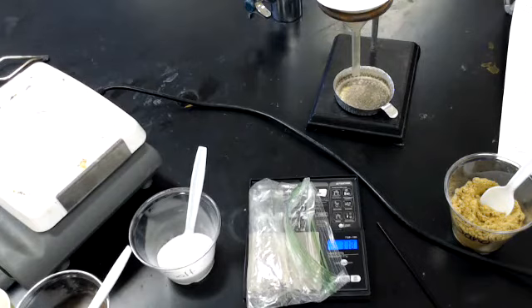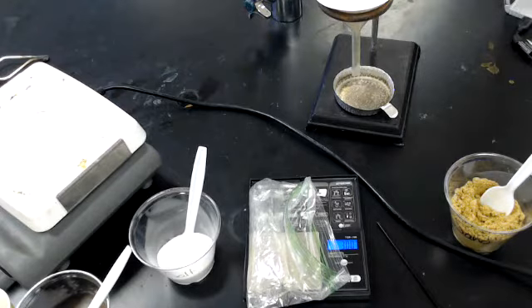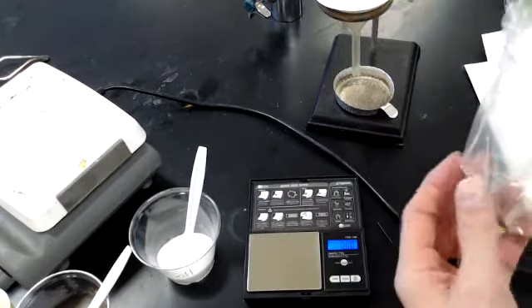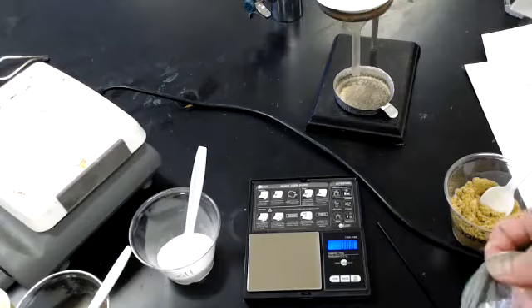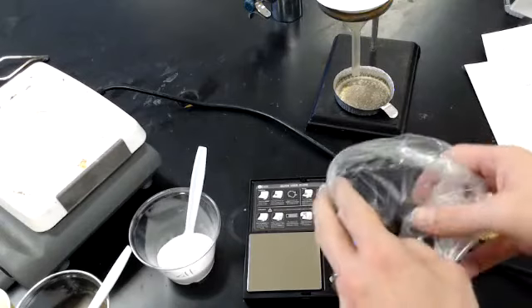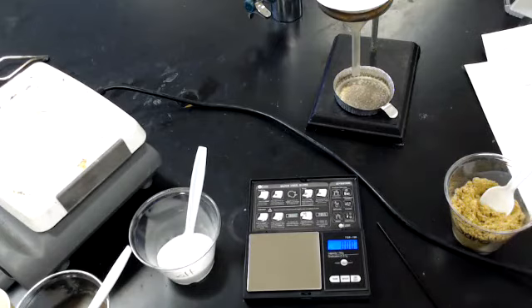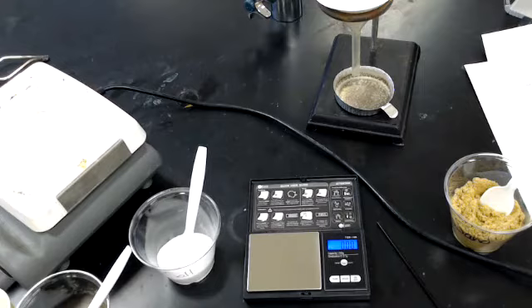I'm waiting for it to settle down. Okay, it has finally settled at 3.02. So 3.02 grams for just the iron in the baggie. Okay, so now I need the mass of the bag by itself. So I'm going to go throw away this iron, and then I would have the mass of just the bag itself because the iron's gone.